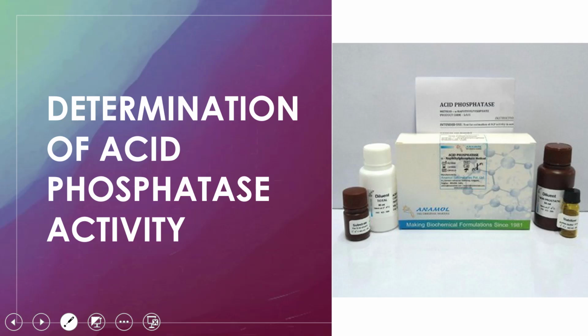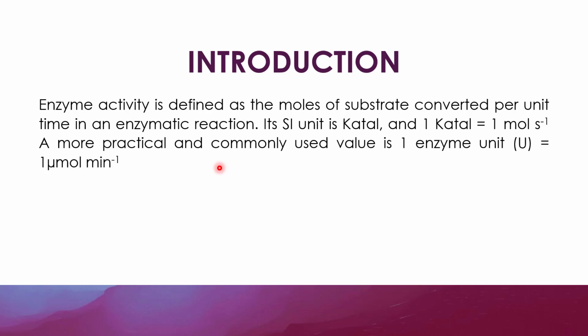In today's class and video, we are going to perform an experiment to determine the acid phosphatase activity. So let's start our introduction by looking at what an enzyme activity is.